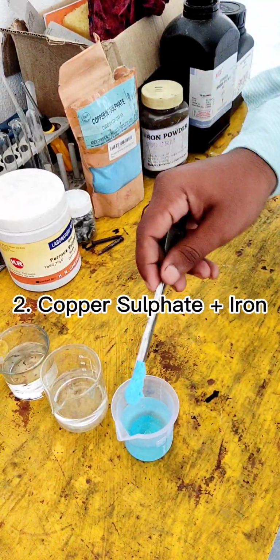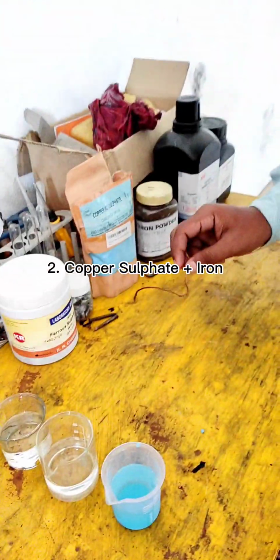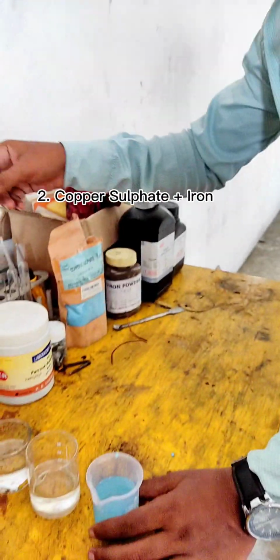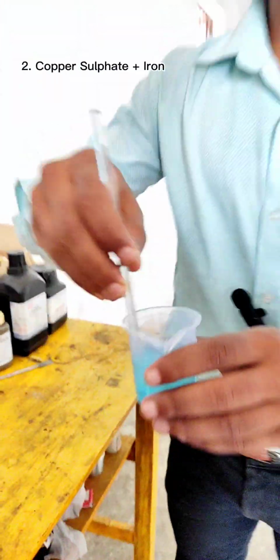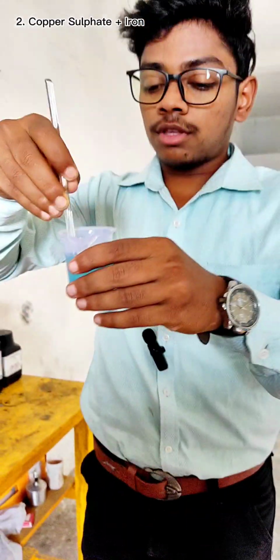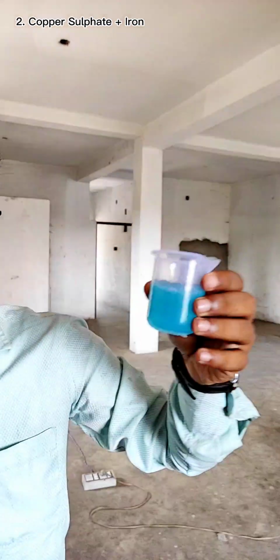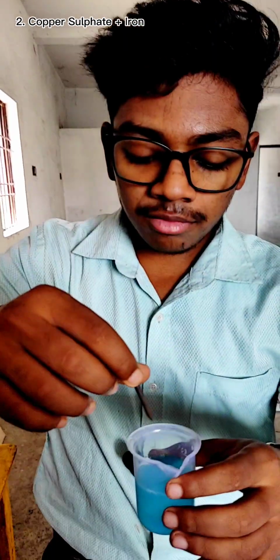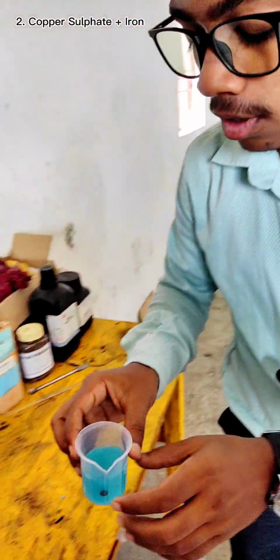We will add an iron nail, and we will see how iron displaces copper. As iron is more reactive than copper, so it will displace copper from the copper sulphate solution. So this is our copper sulphate solution, and this is our iron nail that we can call Fe. Now I am going to add this iron nail into this beaker which contains copper sulphate solution. So after some time we will see that iron will displace copper from the copper sulphate solution.